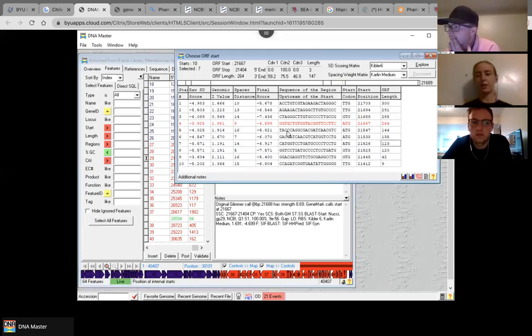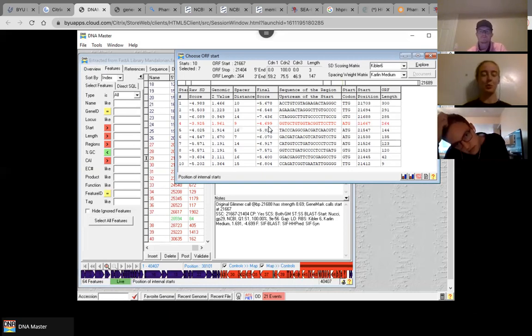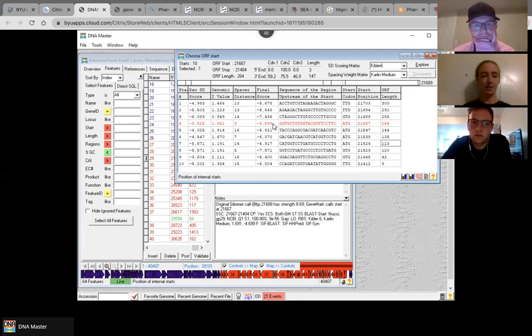And so then it wants to know whether or not this start that we have chosen has our highest final score. So if you notice, all of our final scores are negatives. So we want the one that's closest to 0, so the lowest absolute value. And if we look in this case, that's our start that we have already assigned. So we would put yes.